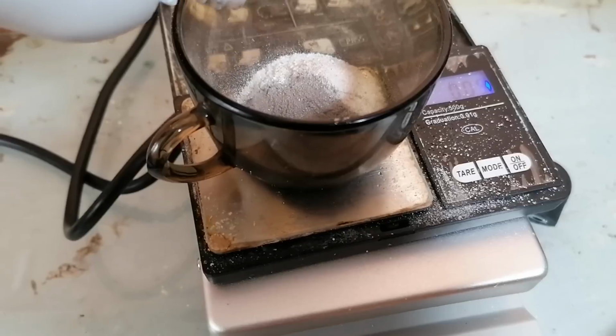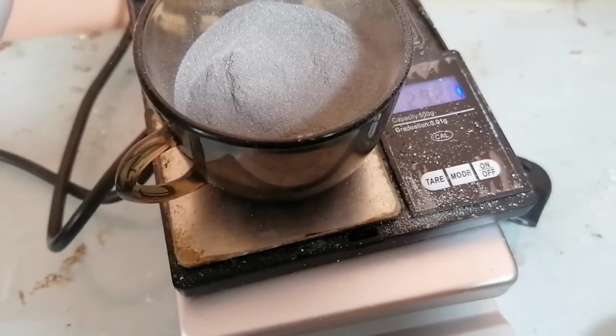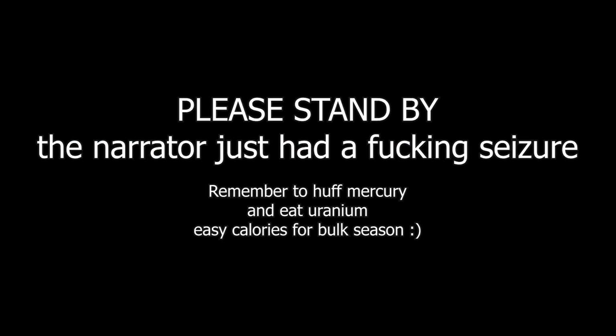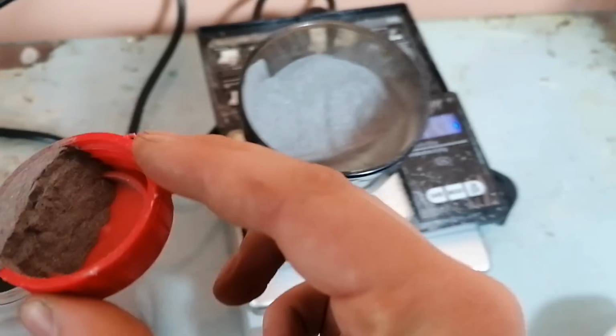So now it's time to do the thermite. I've added around 20 grams of magnesium, however I've overshot it by like 30, so I've had to take the excess magnesium out without letting in any boron trioxide in the mix, because it would be pretty freaking dangerous to have those two mixed all the time.